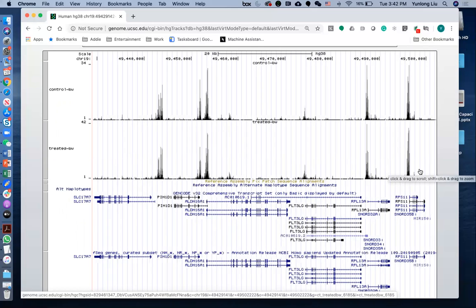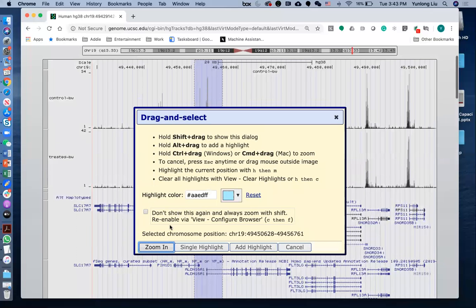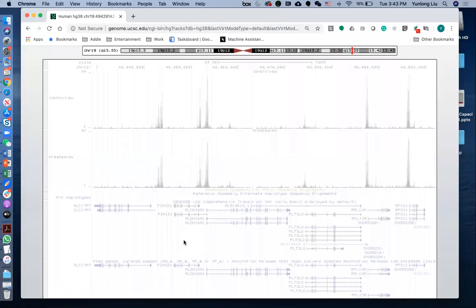From all these signals, after you visualize this, you will have a general feeling of how well your experiment captured the biological signal. It will be a much better feeling compared to just being given a table at the end of the day telling you, okay, here is the list of differential accessibility. So now you have a much better feeling of whether your data really captured biological signals. I cannot stress this enough, and these are really fun to watch sometimes.